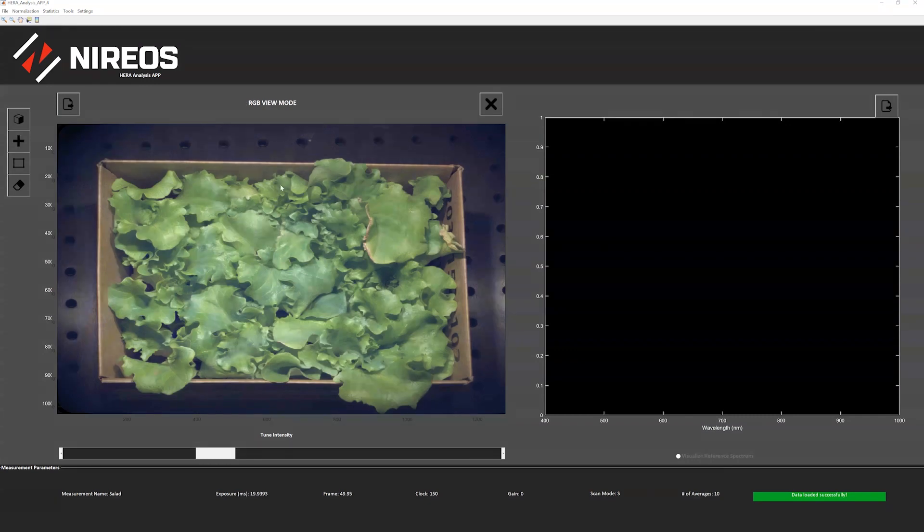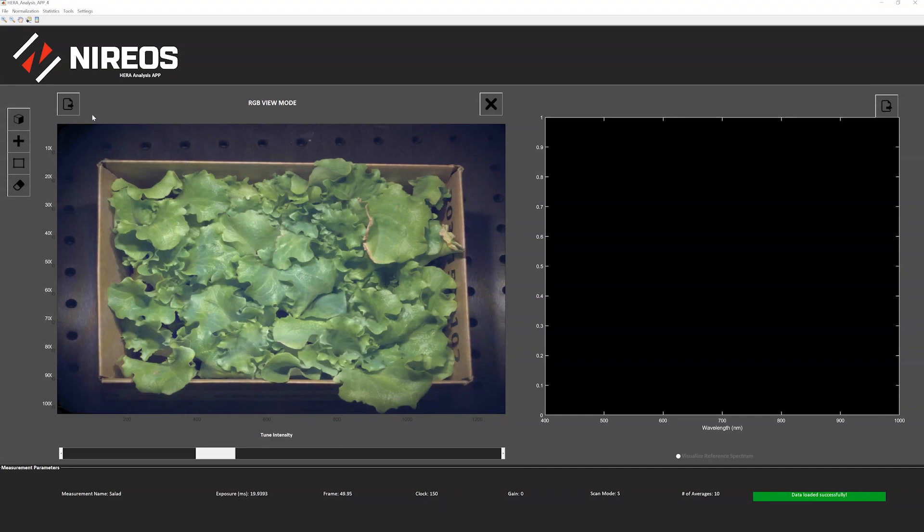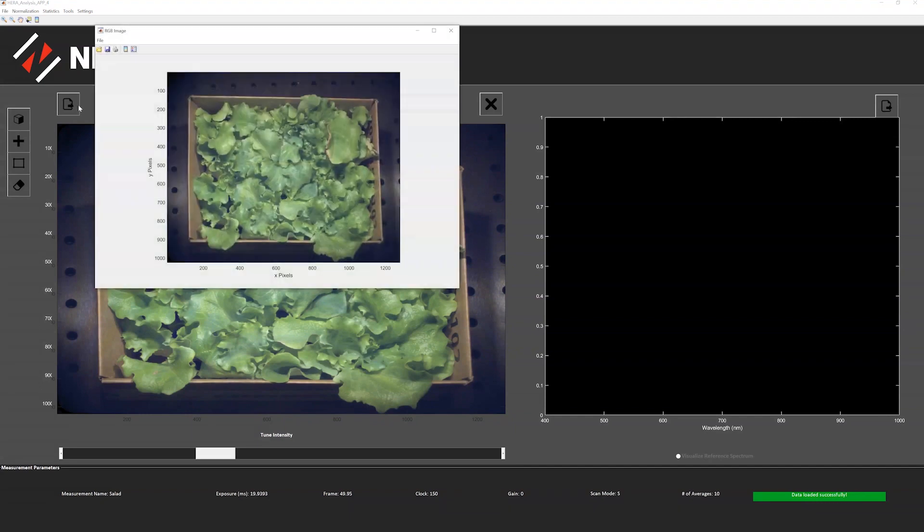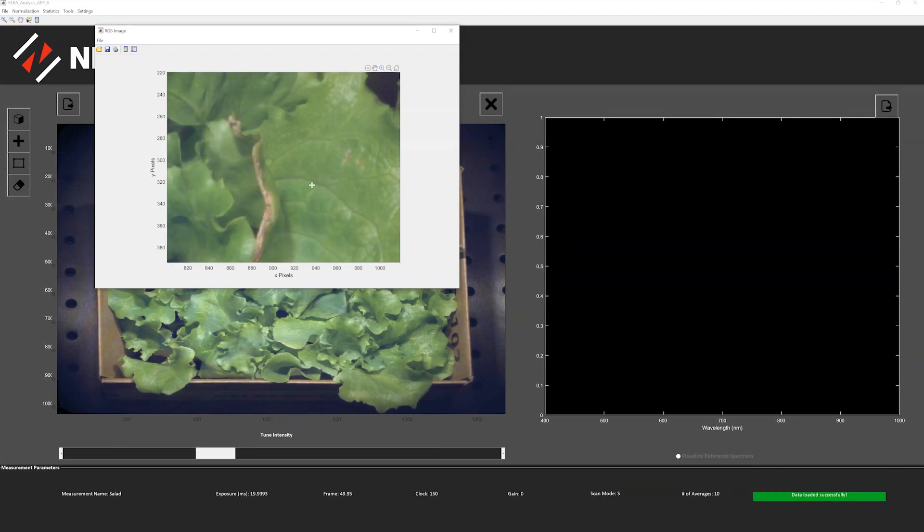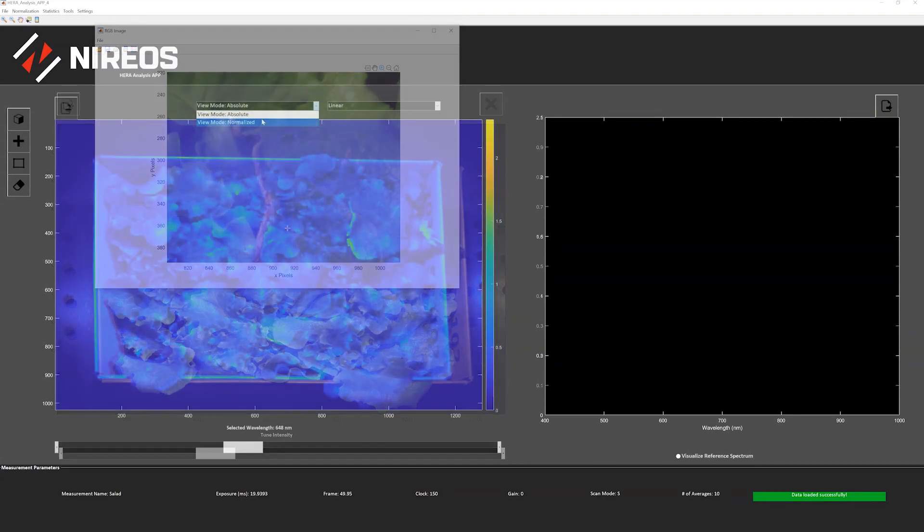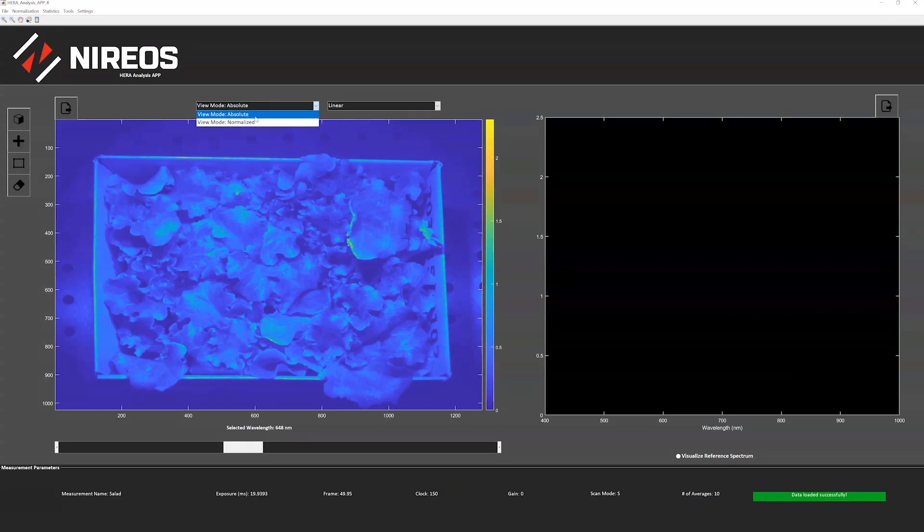This computes the RGB image of the sample. We can also detach the measurement and maybe zoom in just to show you the exceptional spatial resolution that we can provide.